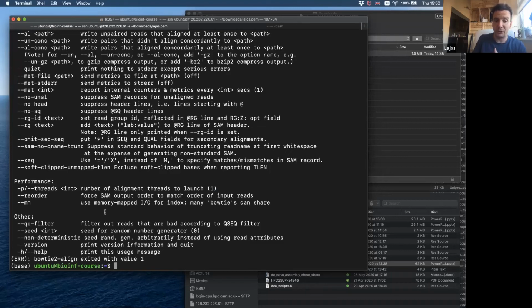And before we do our first alignment, and this can be done by everyone, the first thing we have to do, because I didn't want to replicate the reference genome, is that we can all use the same reference genome. Let me just do the reference genome indexing. As in most programs, if you do BLAST in console mode, you also have to transform your database a little bit. BLAST cannot use a simple multi-FASTA file as the database. You have to create a BLAST database.